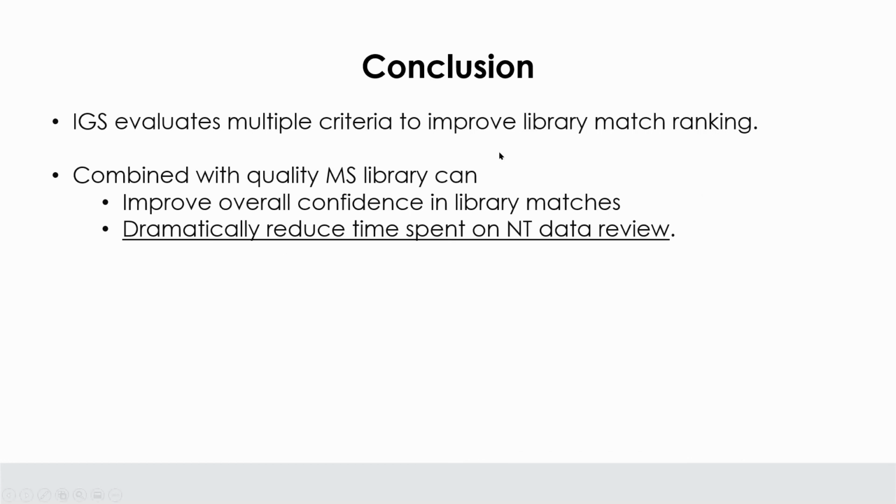Okay. So again, the IGS is part of the HRT platform, and the real value here is that it leverages multiple pieces of information from the NIST library, or really from any library. These libraries are quite large. I think NIST's 2020 library is something north of 300,000 spectra for over 300,000 unique compounds, though obviously there are some replicates in there. But any library that has formula in particular as part of the library match information could be run through the IGS software.